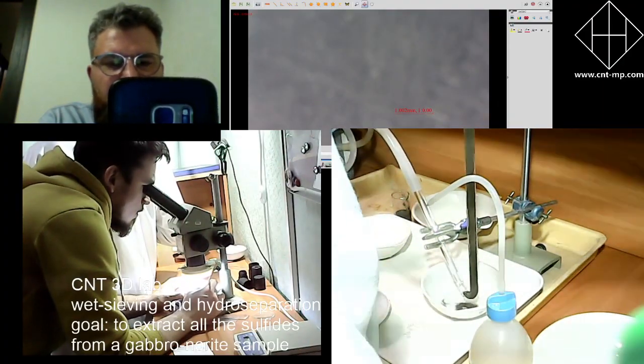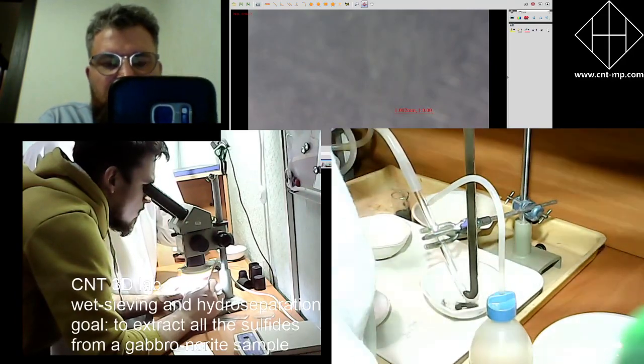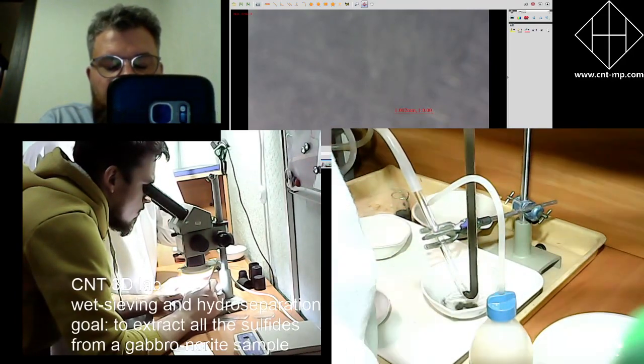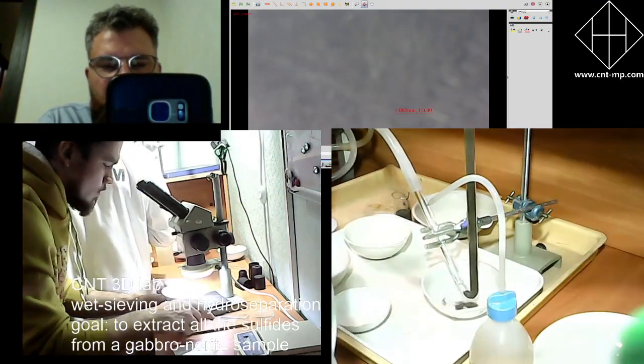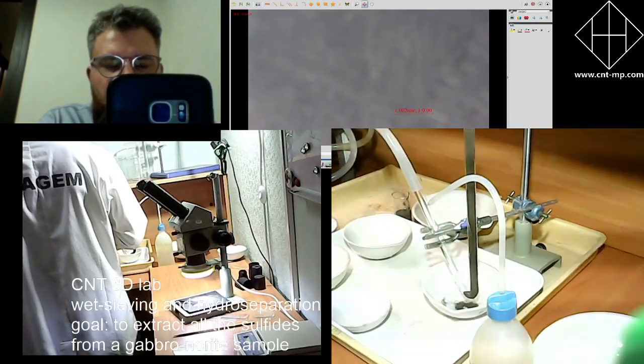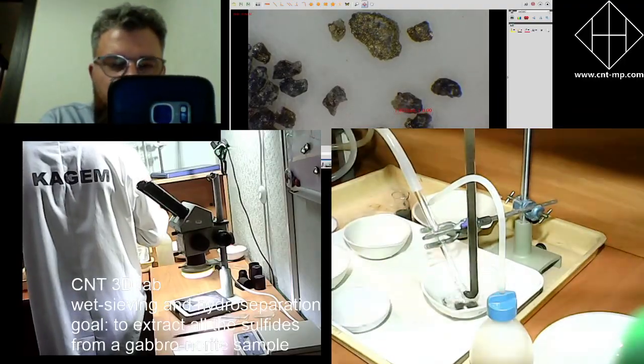This time is optical microscopy. Next time it will be something else. Like whenever we have polished sections prepared, we can use monolayer polished sections for understanding different parameters of mineralogy, such as grain size and analysis on the phase level of each grain.